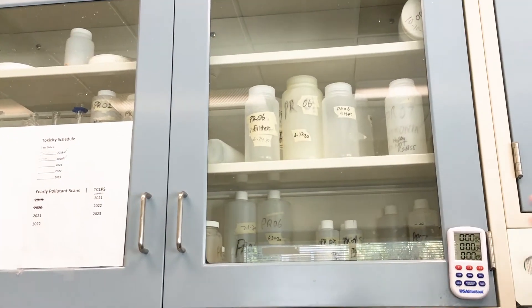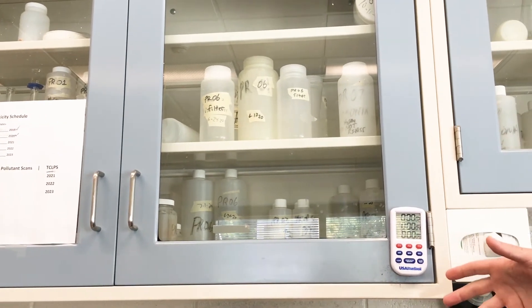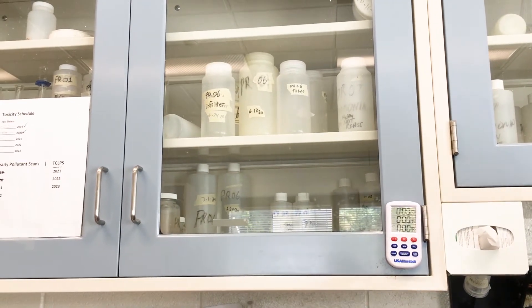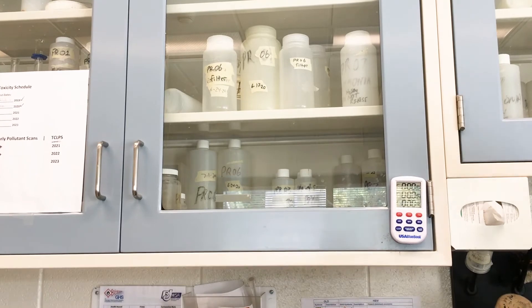Our sample bottles are up here. These will test ammonia, nitrates, biological oxygen demand, and total suspended solids.